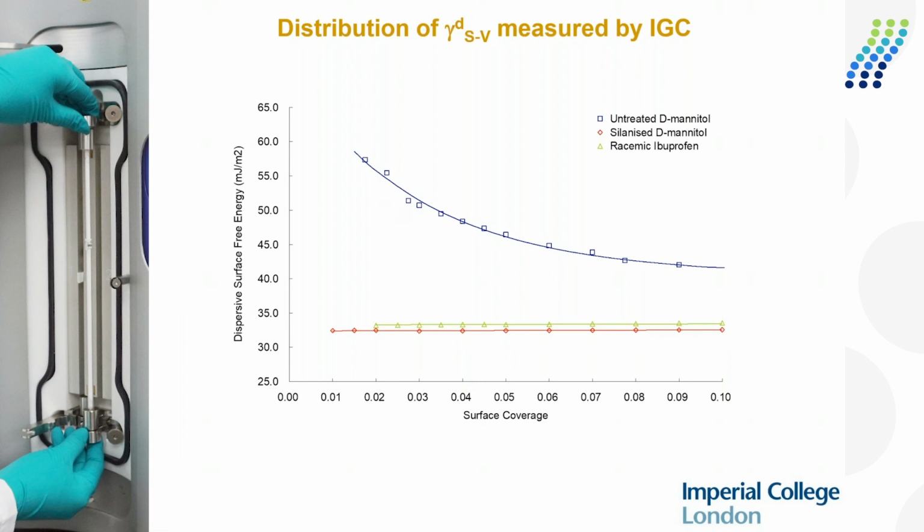How complex may a surface be, for example, co-crystal, percent amorphous, crystalline API? Well, one of the benefits of the study we just did, of course, is mannitol. And mannitol is a very well-behaved powder. It only forms crystalline materials. You've got to try really, really hard to get amorphous material. So this method can be applied to more complex systems, although we haven't done that.